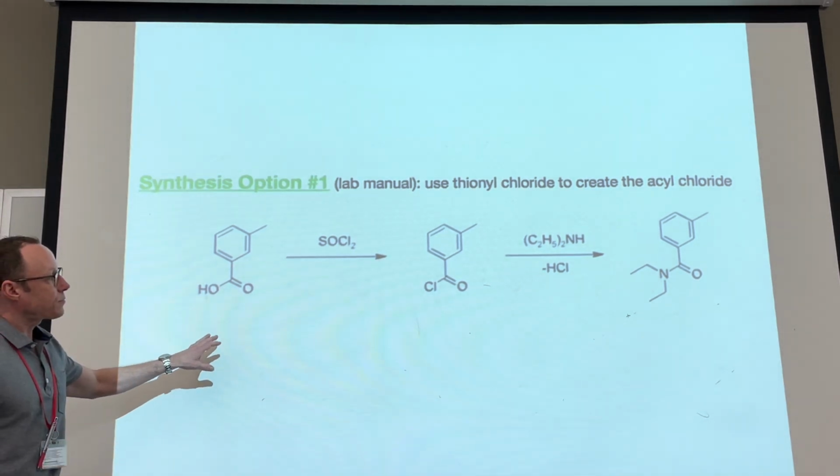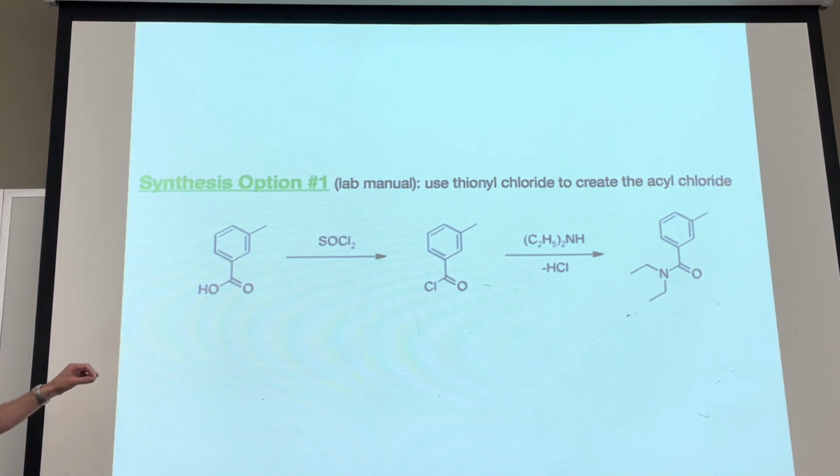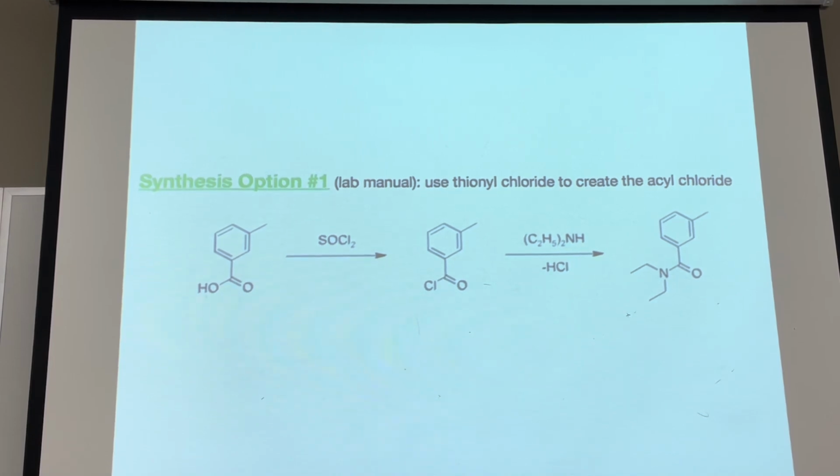But in any case, once you get your reagent, you're going to stab the syringe through the septum and then just push it into the reaction vessel. Let it react for, I think it's 10, 15, 20 minutes, something like that. Then you're going to break down the apparatus and carry the round bottom flask into the fume hood, okay?